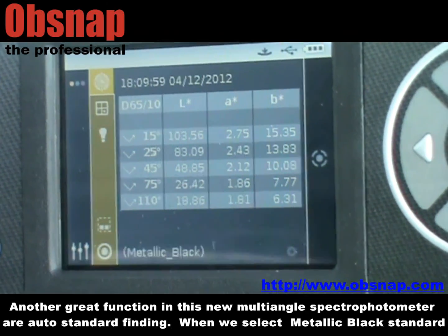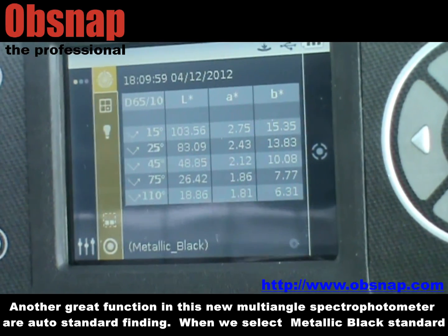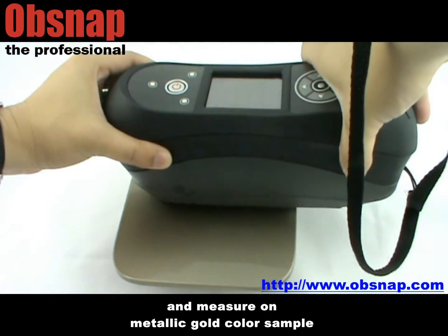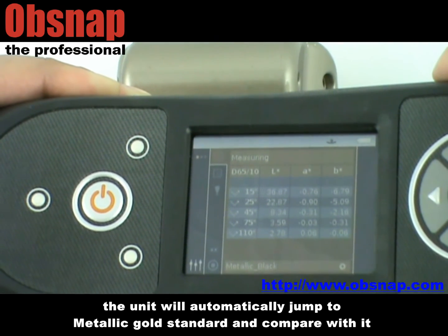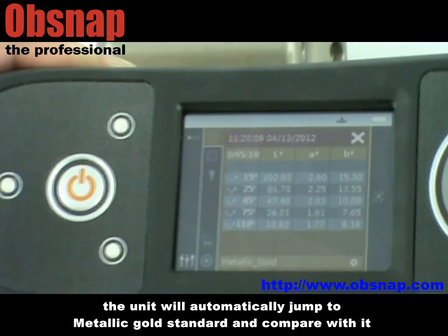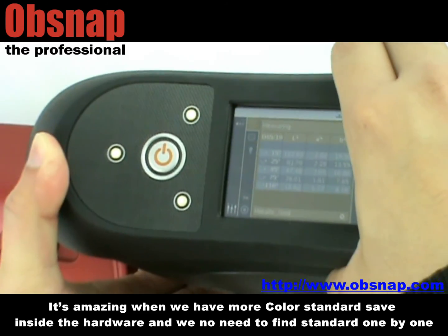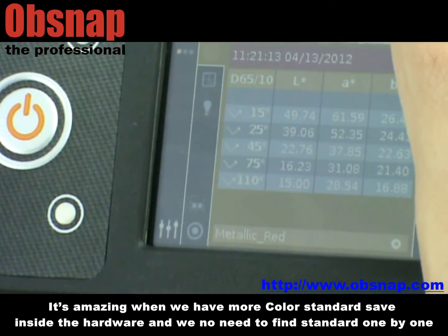Another great function in this new multi-angle spectrophotometer is auto-standard finding. When we select a metallic black standard and measure on a metallic gold color sample, the unit will automatically jump to the metallic gold standard and compare with it. It's amazing when we have more color standards saved inside the hardware, and we don't need to find the standard one by one.